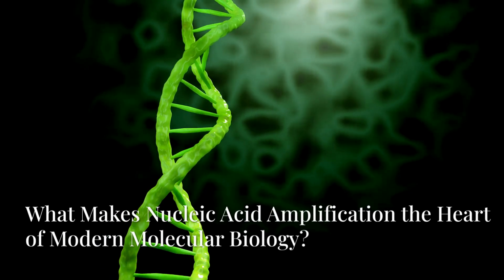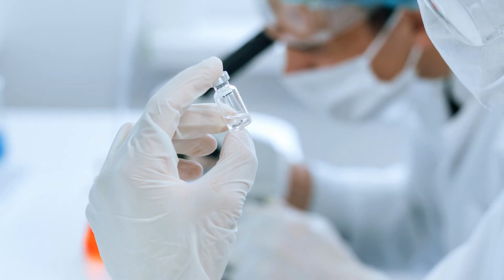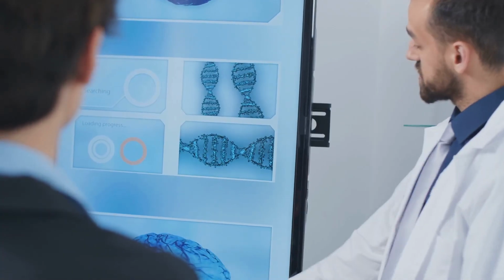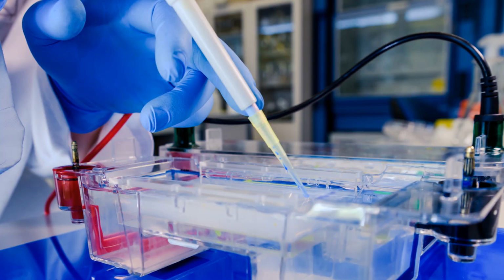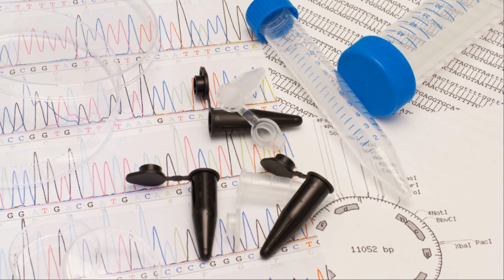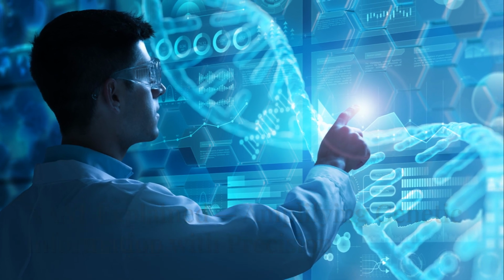What makes nucleic acid amplification the heart of modern molecular biology? Have you ever wondered how scientists detect even the tiniest traces of genetic material in a sample? Today we'll walk you through exactly how this powerful technique works in the lab, step by step. NAAT explained, amplifying genetic information with precision.